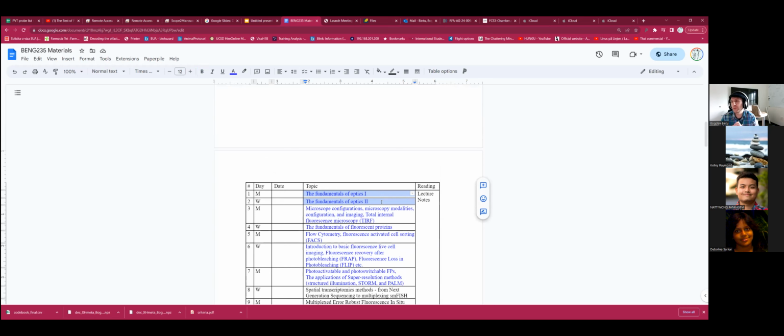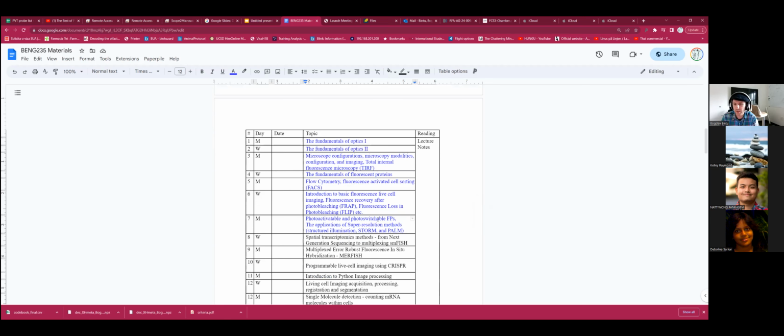I'm also thinking of including some information that is just practically very useful, as hints here, like what is an objective, how to use an objective and so forth. Then, very related to this, obviously, some of the information on microscopy and how some of the fundamental things in optics are applied to microscopy, including some of the basic microscopy modalities, going from confocal to light sheet microscopy to some of the very basic types of imaging modalities. And that's going to continue along the same line up until where you see blue.